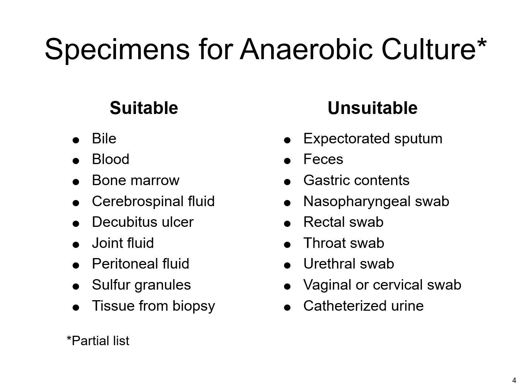Or tissue specimens that could be ground. Usually a bit of the tissue would be put into a little disposable grinder and ground up to release that anaerobic bacteria that's deep within that tissue.